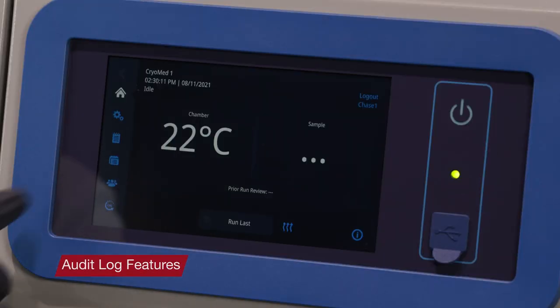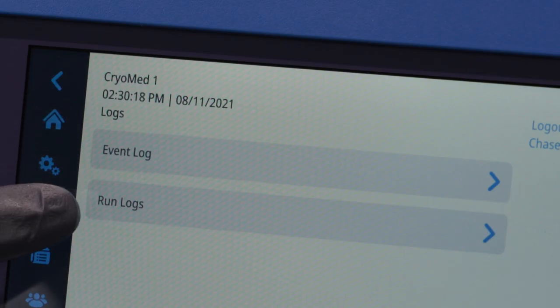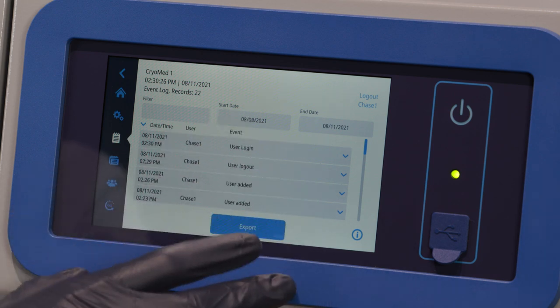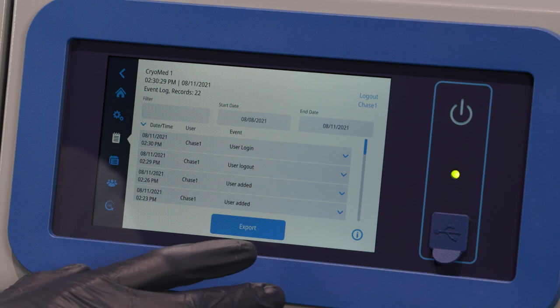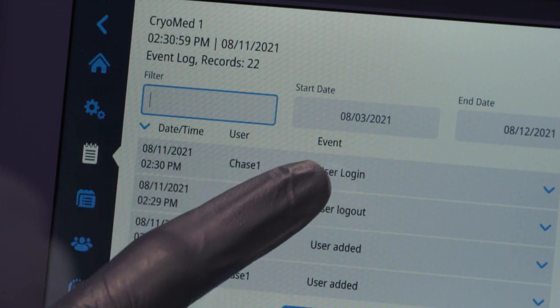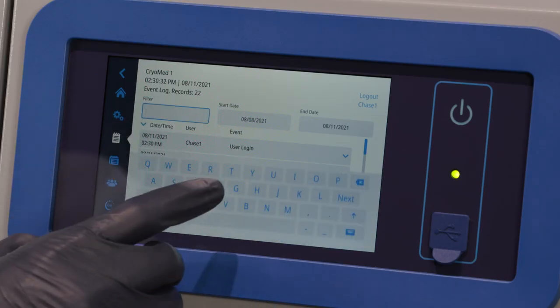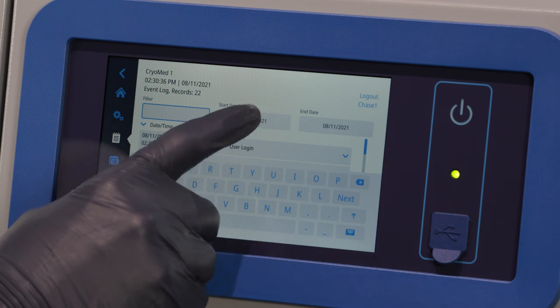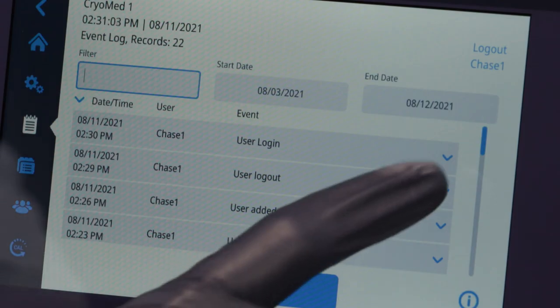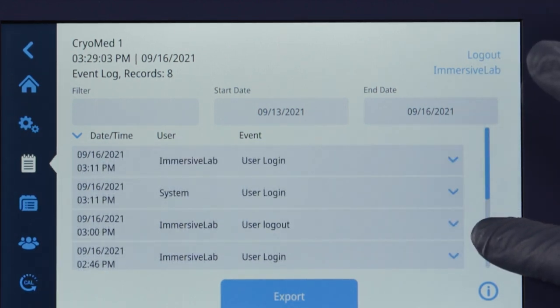The third tab on the left navigation bar is the Logs tab, which contains the Event Log and the Run Log. In the Event Log, all events that have occurred on the unit are recorded. When you select the Event Log button, a list of events from the last three days will appear in descending order by default. You may sort the list by pressing on the date/time, user, or event in the header row. The Filter option allows free text to be entered in the header row, and the list will filter wherever that specific word occurs. Up to three comma-separated text entries can be entered. Pressing on an event will expand the event detail. As you scroll down the list, additional available data will be displayed.